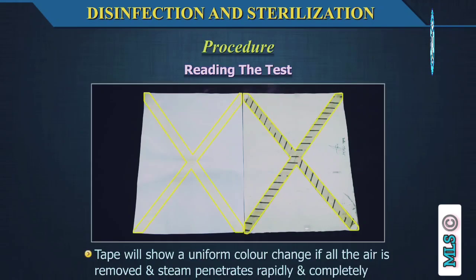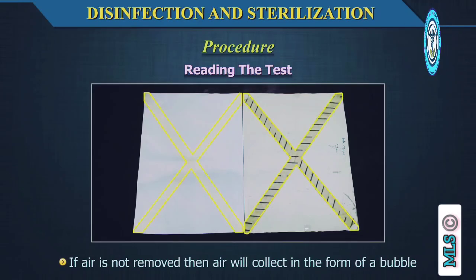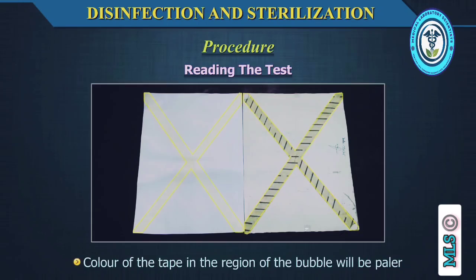Reading the test. The tape will show a uniform color change if all the air is removed and steam penetrates rapidly and completely. If all the air is not removed, then air will collect in the form of a bubble. The color of the tape in the region of the bubble will be paler than elsewhere because of the low temperature and reduced moisture level.